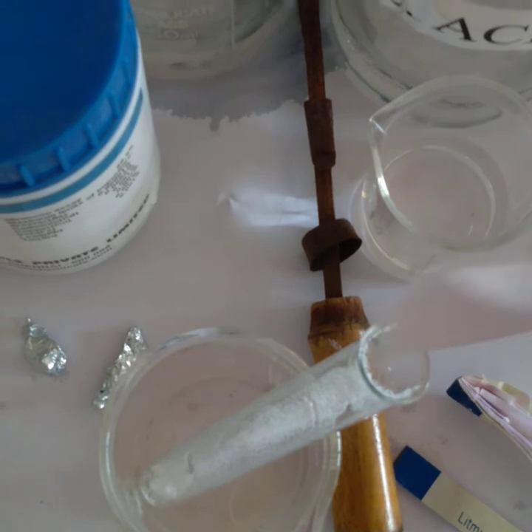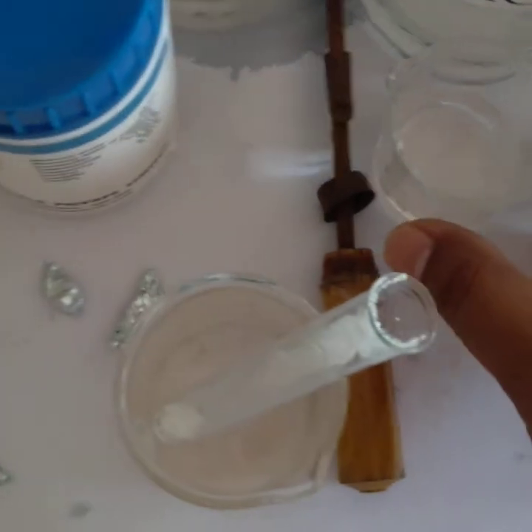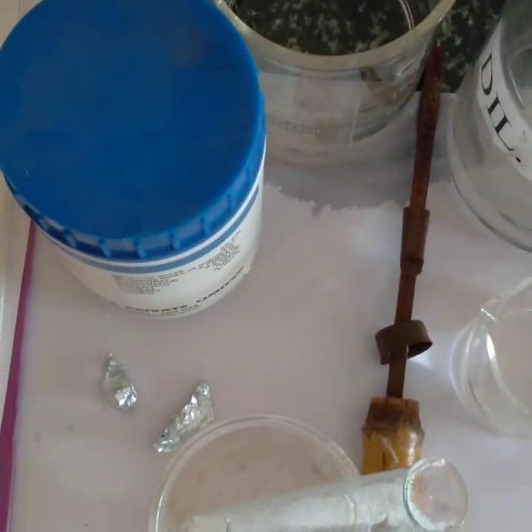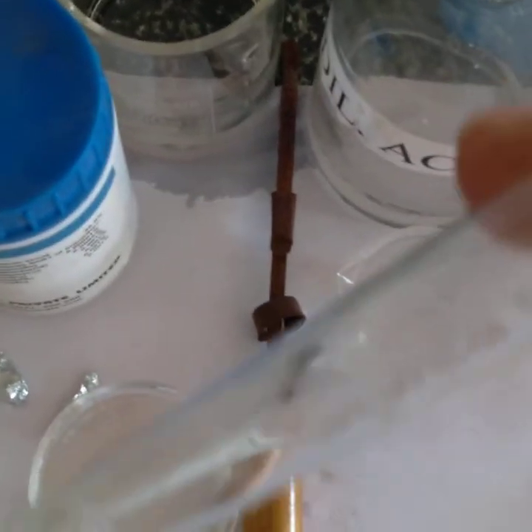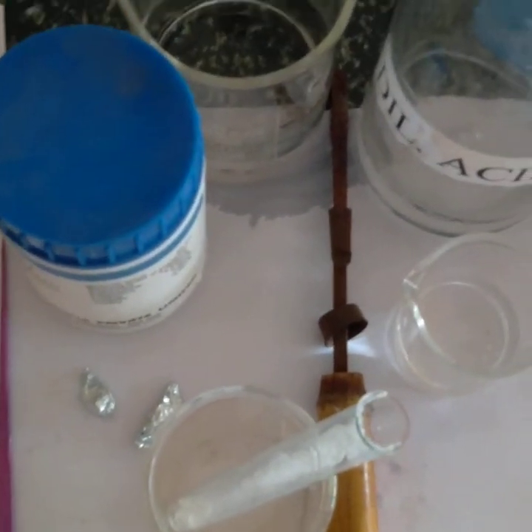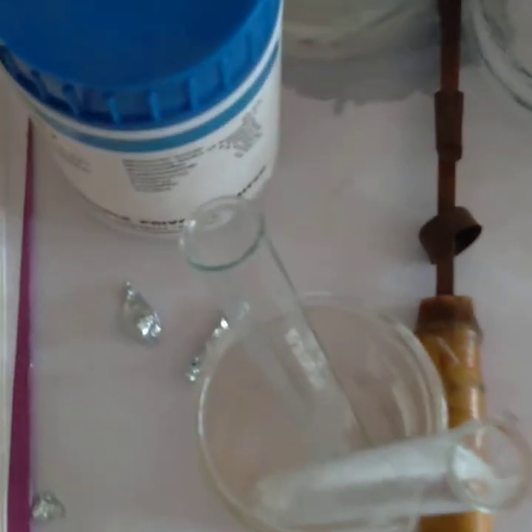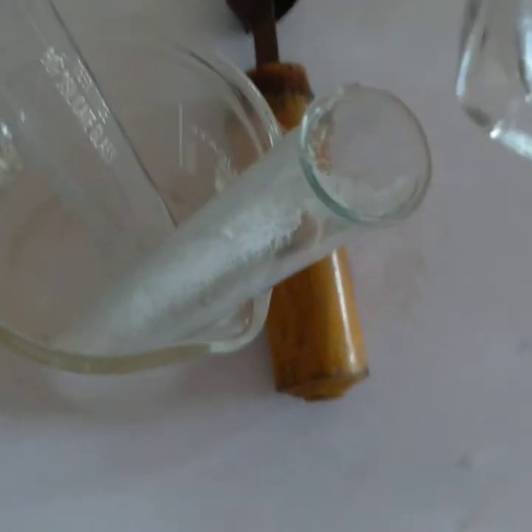See, I have put sodium carbonate into the test tube for the test. Okay, what I am going to do is add HCl to it. Before adding HCl, I have already taken some lime water in a test tube. So this is lime water. I have already taken this lime water. You can see the lime water. We have to take lime water over there. So I have taken it in one test tube. Now I am going to slowly add dilute HCl to the test tube.